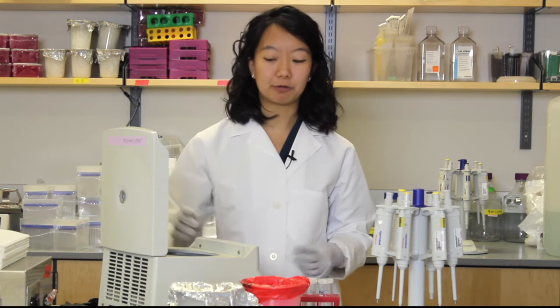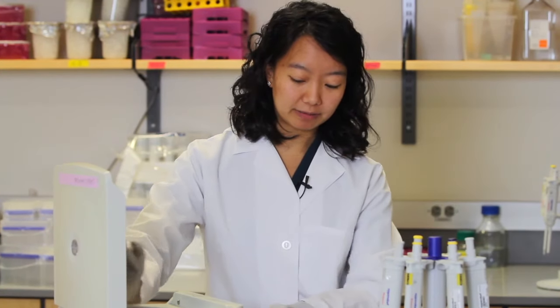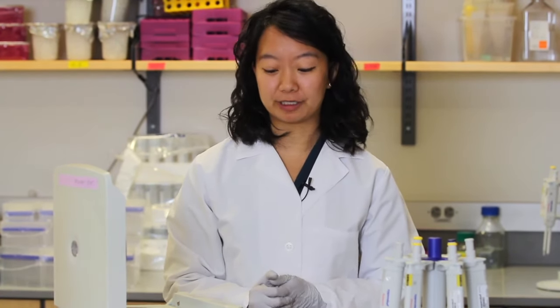But you can imagine that to get the same amount of force, a different centrifuge with a different radius or a different size might have a different revolution per minute, which is why we use this other unit, which is called RCF, in order to give you a more uniform unit with which you can measure different centrifuges. RCF is relative centrifugal force and measures everything relative to G, the gravitational force, which is also why in your protocol you might sometimes see this written as times G.